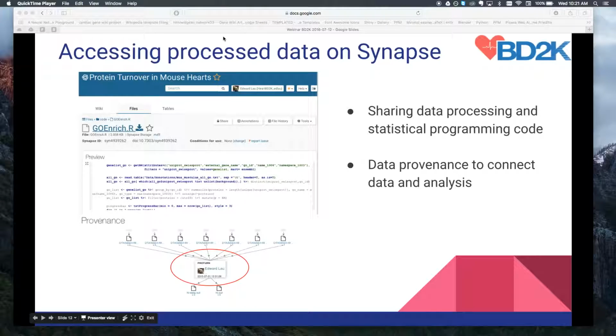Raw mass spectrometer files are almost 1 terabyte in size, so there's the question of how often users can access them and rerun the entire analysis pipeline. Having only raw data will also limit the analysis opportunities to only users with a certain amount of computational skills and resources to reanalyze the raw data files from scratch.